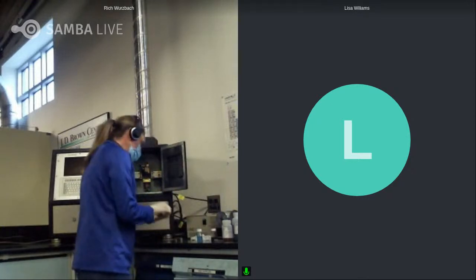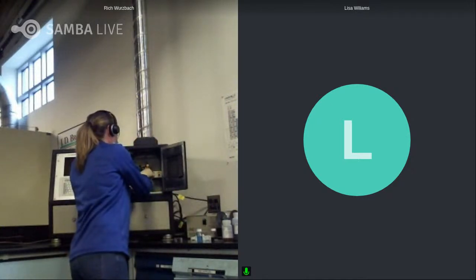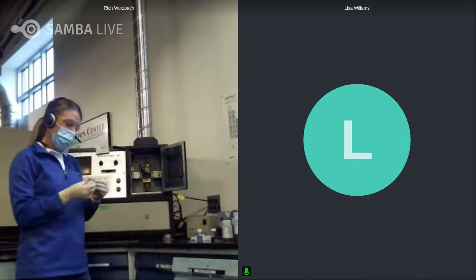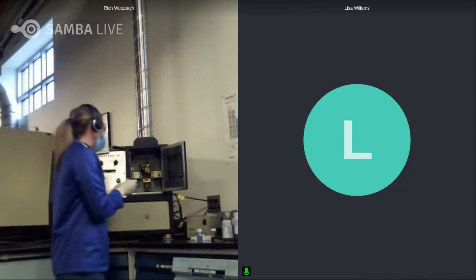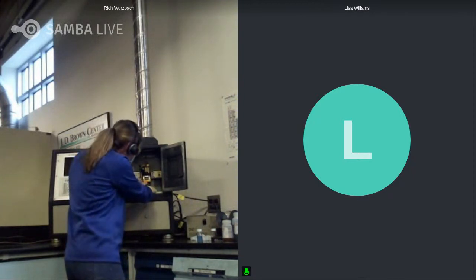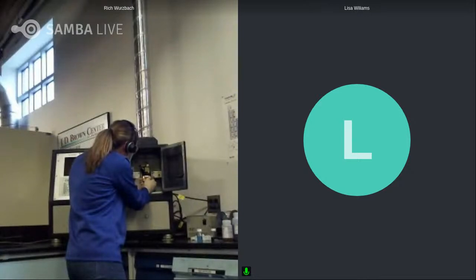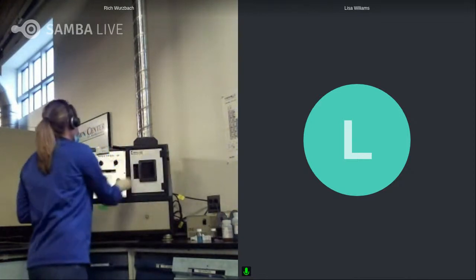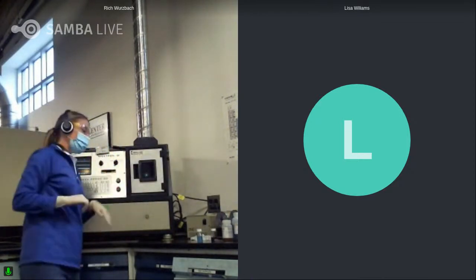And we're going to stick this into the spectrometer. Now, normally, we'd be good to go with an oil, but for the grease, we're going to cover this with our fuel shield. We want to minimize those flames, and then the cup is just going to come right in and fit into the spectrometer. Then we're going to gap our rod accordingly, make sure everything's gapped properly, and then we're going to go ahead and hit start.